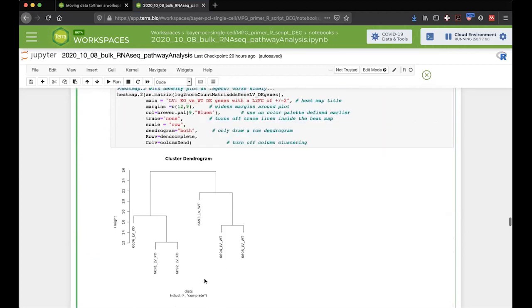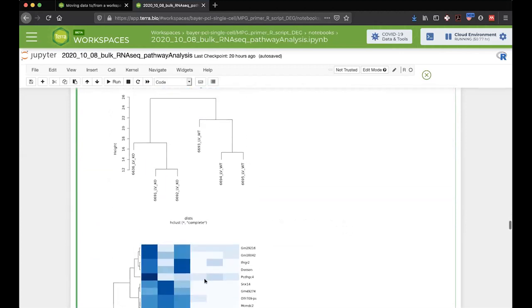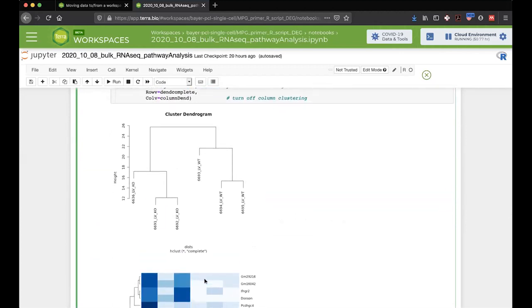There was another question that branched off your dendrogram check that you always do, which is such an important step. It's relating the experience of having a comparison with 1 female mouse and 4 male mice in the experimental group and 5 male mice in the control group, and then identifying X-linked genes as the most significantly differentially expressed. So do you recommend doing a leave one out analysis to ensure that there's no single outlier sample in your batches?